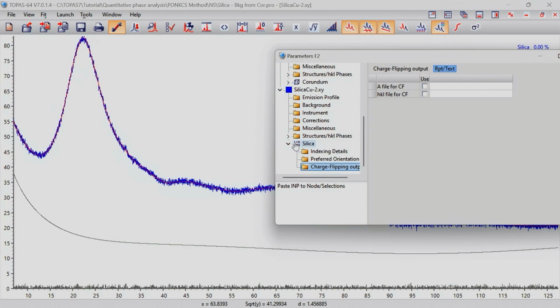It depends on what you prefer, and it is often also case dependent. In principle, the Pawley method converges better and is more stable, but it is perfectly fair to use either of them.